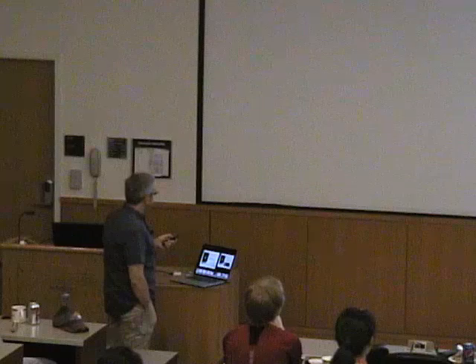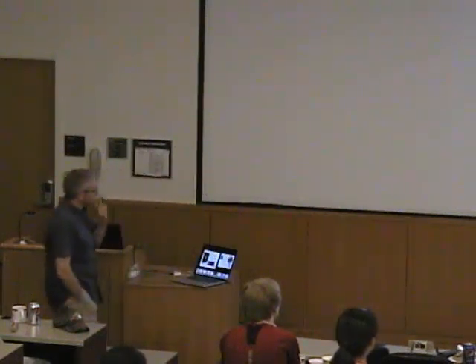And the process that takes you back and forth at that point is a Fourier transform. This Fourier transform might seem a bit difficult, but in fact, it's what a lens does. So a stupid little piece of glass or plastic can do it. It shouldn't be too hard for us to do it, you would guess. Okay, this all started rather early.